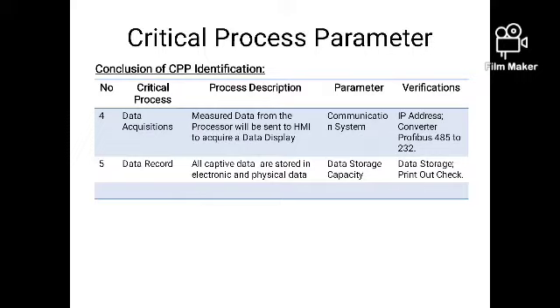Fifth, data record is another function of the air particle counter. This data record should have integrity before exposing the data as the result of measurement. Please check the data access, data storage and capacity, data presentation in electronic and physical form, and the data security system. Next.